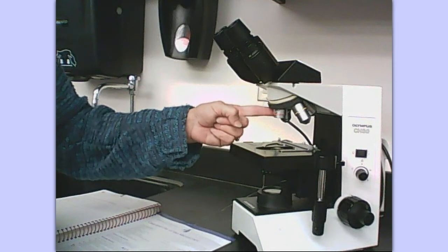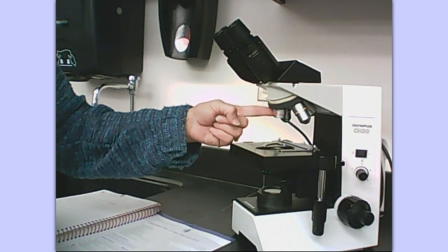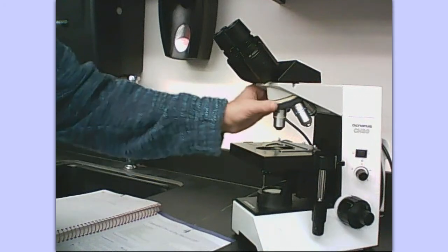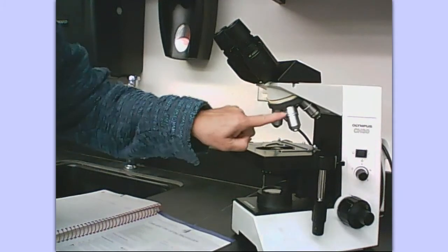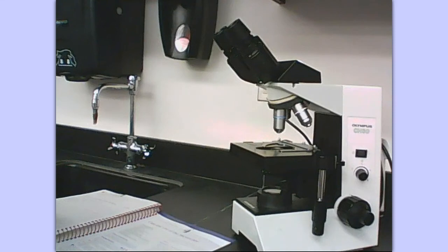We always start, when we're focusing in on an object, with the scanning objective, and then go to higher power. This is the low power objective. Now let's go to the high power objective — it has a little '40' on it, so its magnification is 40.